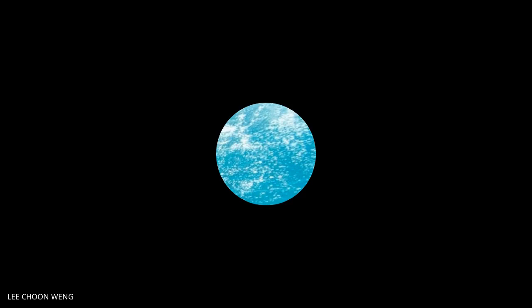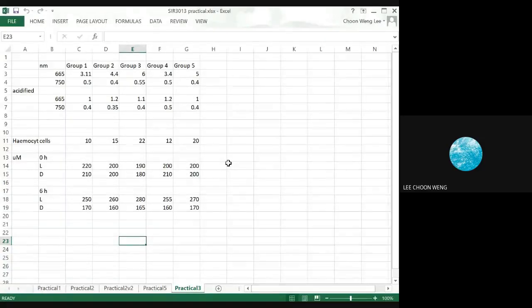Okay, can you see the Excel file? I'll send you this Excel file later. This is just dummy data to give you a chance at analyzing, using the equations in the practical schedule to analyze the data.